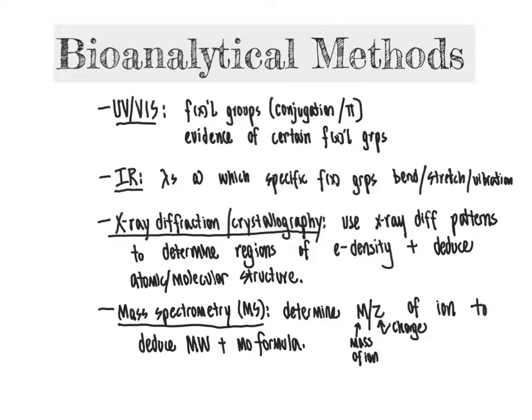Much like UV-Vis and IR though, in most cases you can't determine with certainty the complete chemical structure of the molecule based on its mass spectrum. Instead, you get information about the molecular formula and maybe some preliminary information about the structure. If, for example, you use the mass spectrometry experiment to break the molecule into fragments, you can analyze the mass to charge ratio of some of those ionized fragments to start to piece together the structure.